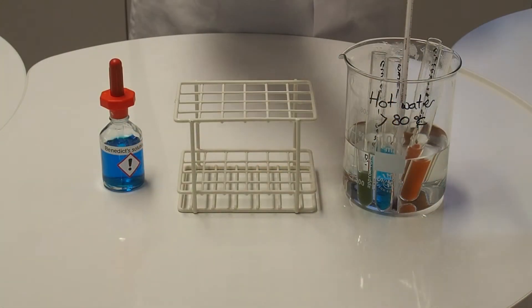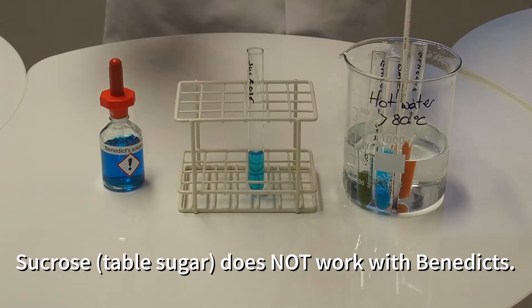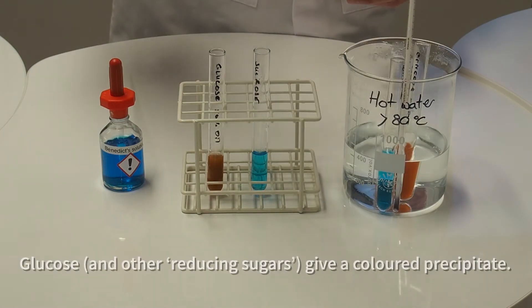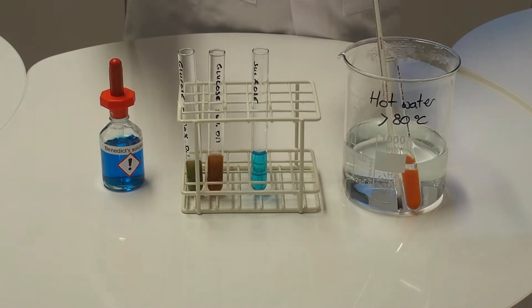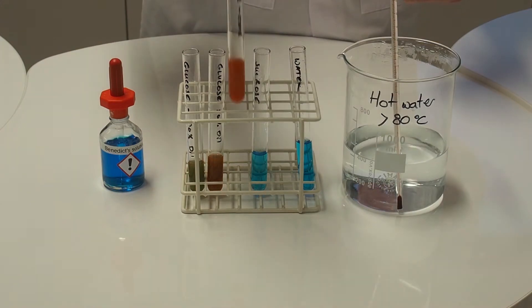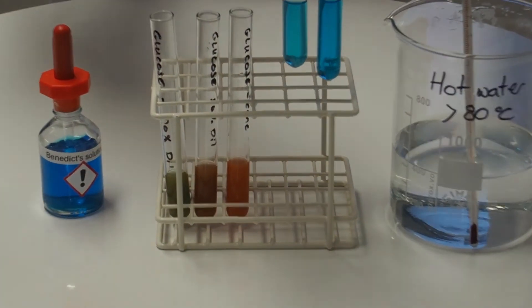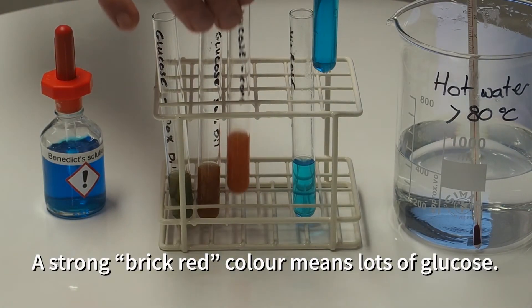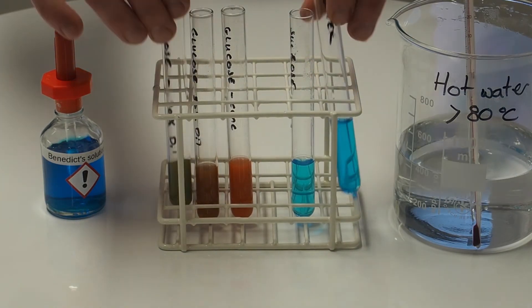After five minutes is up, we take them out and we can see the colour changes in the tubes that contain glucose. The sucrose tube has still stayed blue, but the intermediate glucose concentration is kind of a yellowy-brown, we've got a greenish one for the very dilute, and then we have this colour here, which is described as brick red, for the most concentrated glucose. If we compare them with the original, you can see the sucrose clearly hasn't reacted, and then we've got a gradation of colours in the glucose depending on how concentrated it was.